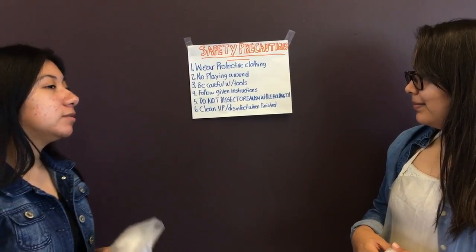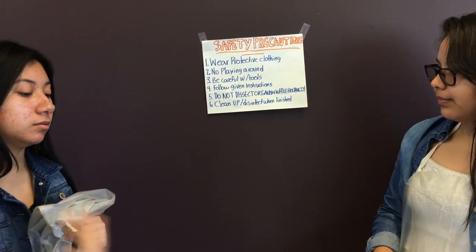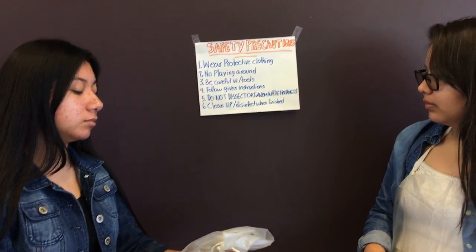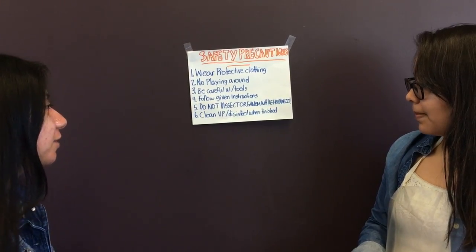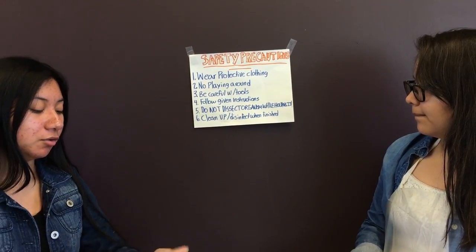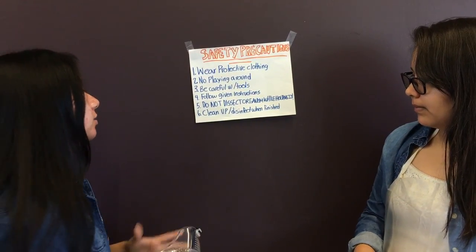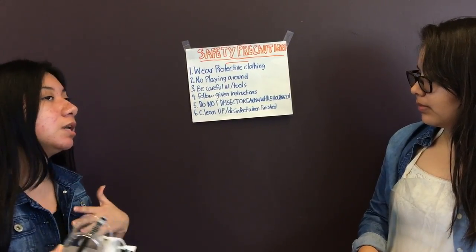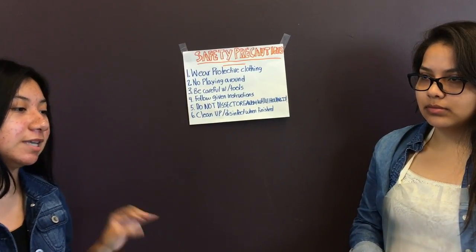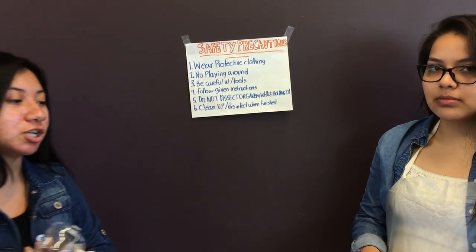You must follow given instructions. Your teacher is much more aware about the organism that you're taking care of. So do not dissect the organism while holding it. When you're holding an organism, you risk cutting your skin or harming yourself. And you must clean up and disinfect when finished because it is a very messy procedure and you have to clean up your area as well as wash your hands when you're done.